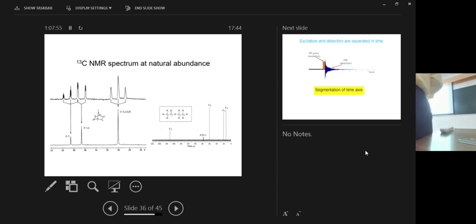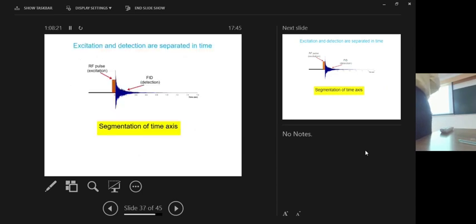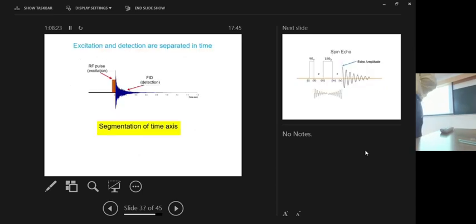And therefore, you can record the spectra of carbon-13 at natural abundance, and this becomes an extremely useful tool for the organic chemist. How many carbons are there in your molecule? Record a carbon-13 decoupled spectrum. And which are its neighbors? Record a coupled carbon-13 spectrum, a proton-coupled carbon-13 spectrum. Then you will see what the multiplet structures are. And that is how this becomes an extremely important technique, and all this became possible because of Fourier transform NMR.